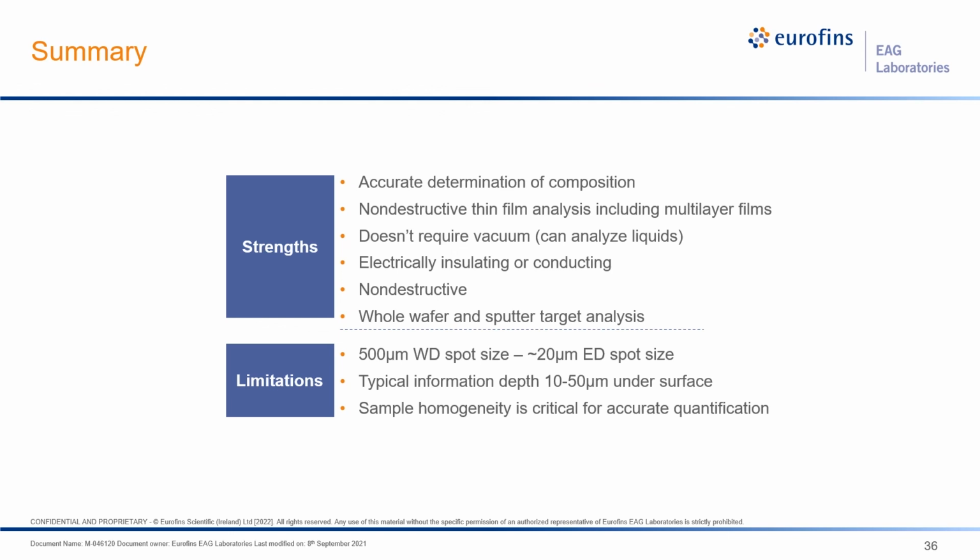The last 2 points are related. When analyzing solids, we have to remember that XRF is essentially a surface analysis technique, albeit with several microns to millimeter sampling depth. Therefore, sample homogeneity between near surface and bulk is critical for accurate compositional measurements.